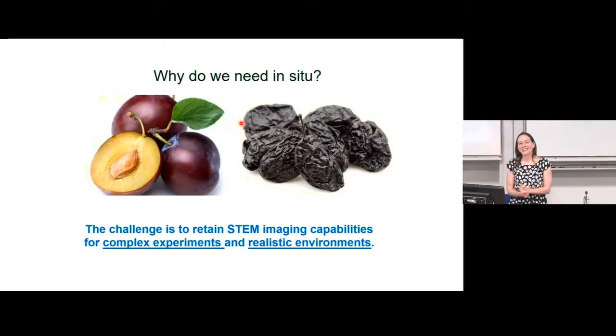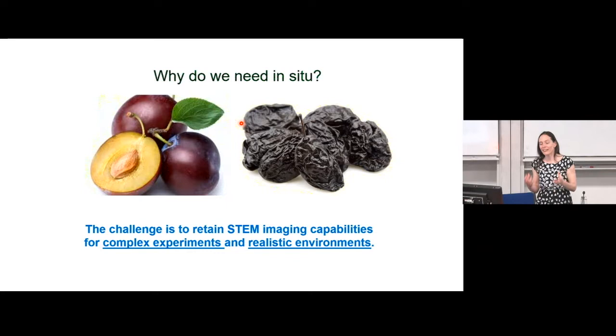So there is also a problem with the fact that the electron microscope requires a high vacuum environment, in order to prevent the electrons interacting with the air, which would also produce strong interactions. Electrons are great because they interact really strongly with atoms, but that also means it's challenging if you've got atoms that you didn't want to be looking at. So you need a vacuum environment inside the electron microscope.